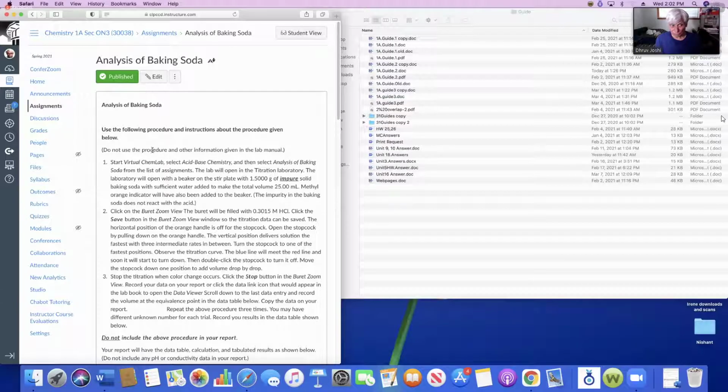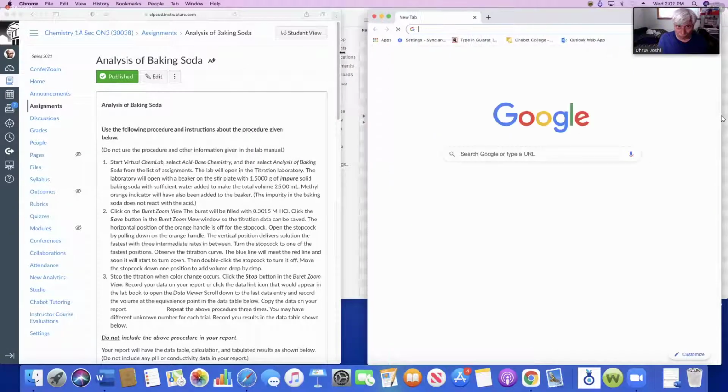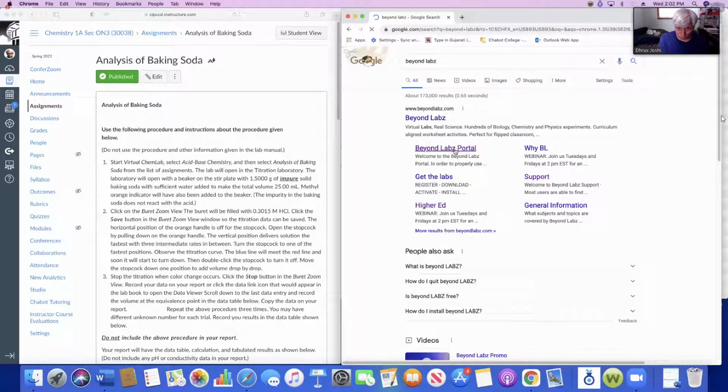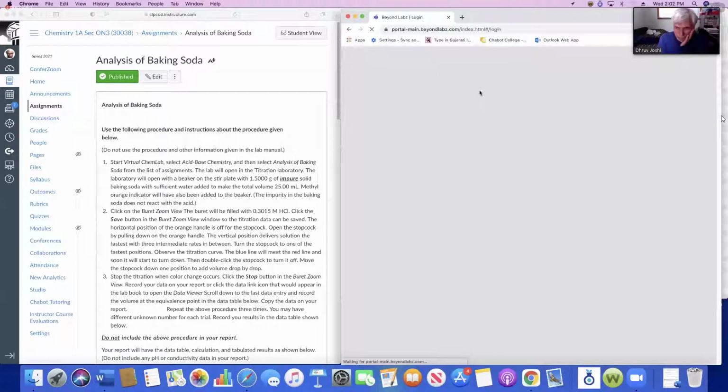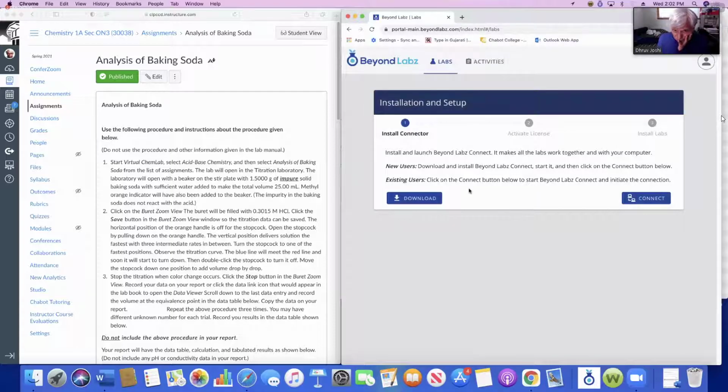Okay. So, number 1, start virtual chemistry lab, select acid-base chemistry. All right, let's go over there. We're going to start virtual chemistry lab. Beyond labs, oh, beyond lab portal. There we go. Logging in.